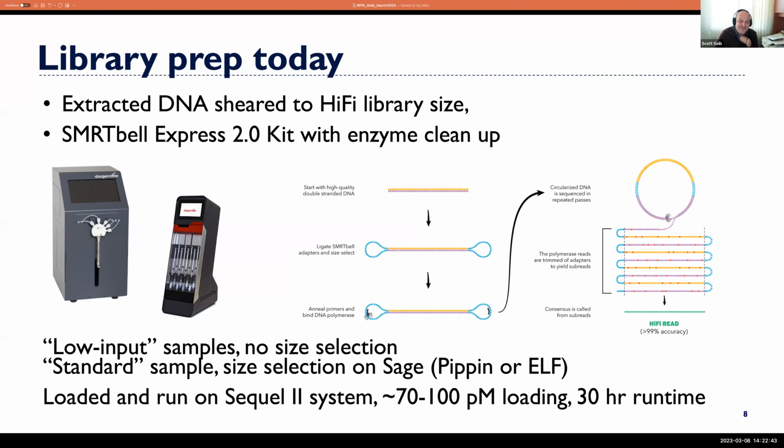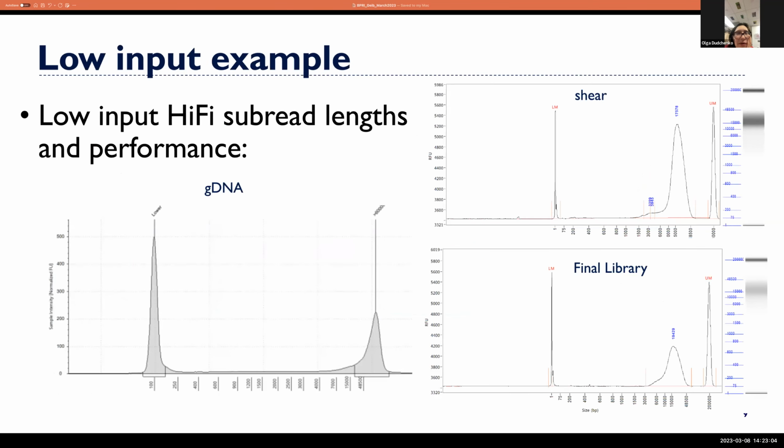I love interactive. I wanted to ask, so basically you're saying that size selection is so lossy that it's pretty much never worth it, even as a compensation for the smear or degradation. So my question is, in those cases, we just never have those 10 microgram samples in practice. If you're doing loads of this and in practice you never do this, that probably means it's not a good strategy.